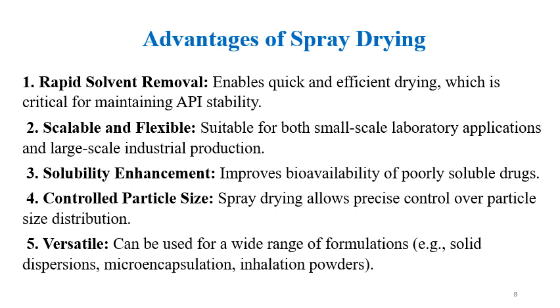So, precise control can be there by using the spray drying for the particle size distribution. Versatile process. Solid dispersion technology by spray drying can be used for a wide range of formulations like solid dispersions, microencapsulations, and the inhalation powders.